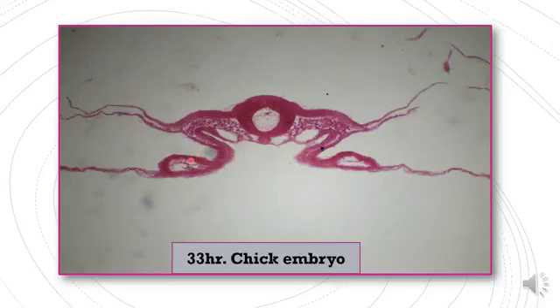Here the anterior fold is represented by a limb of the U shape of the heart tube, while the posterior fold is represented by the neural tube, ventral to it the notochord, and the dorsal aorta.